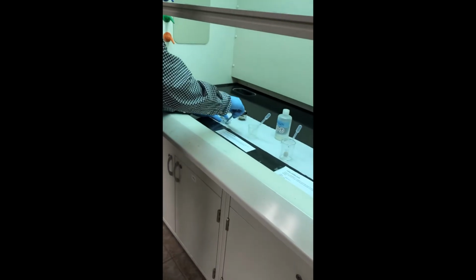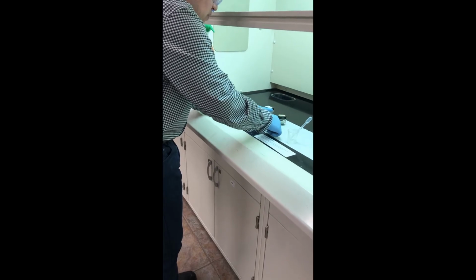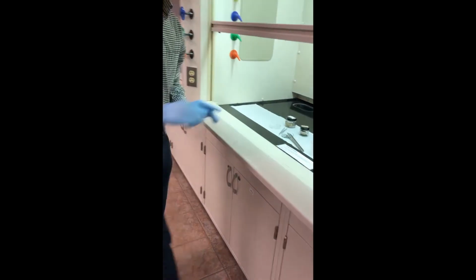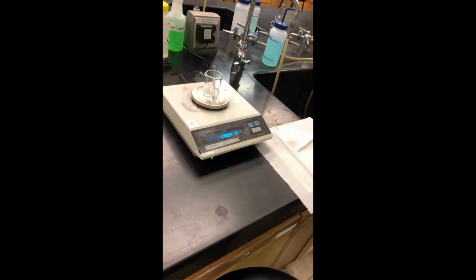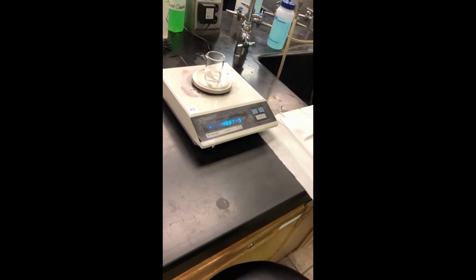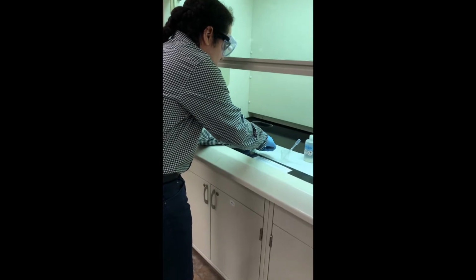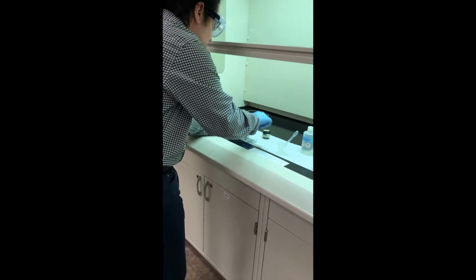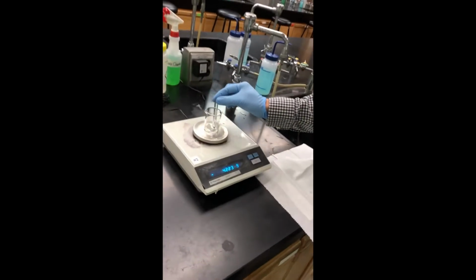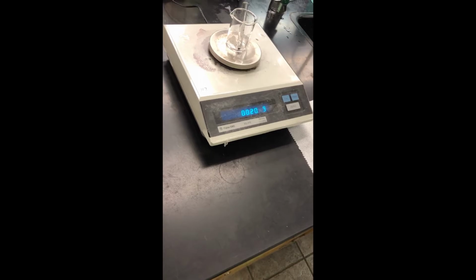Let's now transfer our copper. And let's now record the mass of the copper in test tube 3. Let's add a little bit more, so that way we have a substantial reaction. We don't want too much, but we don't want less than 0.01 either. Okay? So here is the mass of copper in test tube number 3.